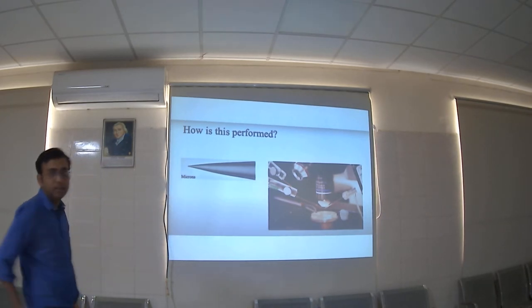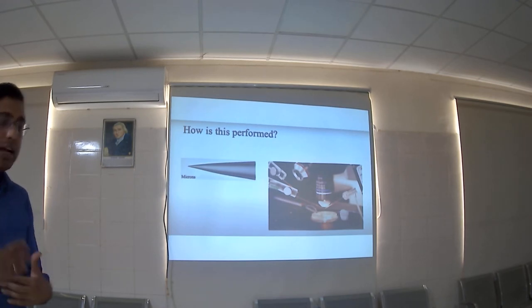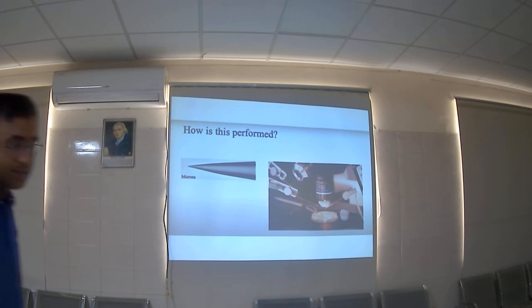the electrode, the patch electrode, and then you have a micromanipulator, and then you do this same, and then you have this solution outside, right? The bath, the extracellular solution, जहाँ पे आप अलग अलग manipulator और अलग अलग चीज़ को test कर सकते हैं, efficacy test कर सकते हैं.